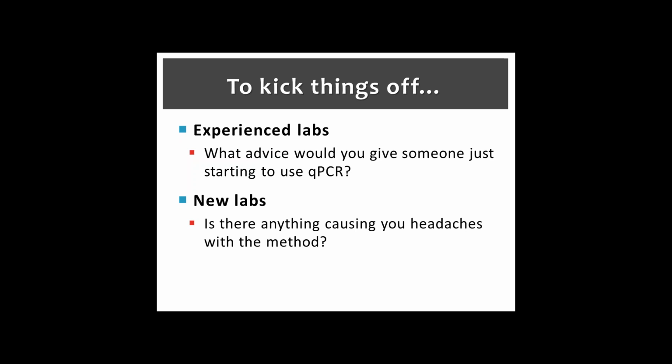All right, so in our quality assurance project plans, we have set it up in a stepwise process for all the new labs. We don't have certification. We're living by a QAP. So we use the QAPs to go through this stepwise process. First, we want your lab to be able to run a standard curve that makes sense. Once your staff are running the standard curves and everything's beautiful and you're like, yes, we got this, now you're going to get the E. coli spike samples from MSU or EPA. Then you start running those samples to see, can you run E. coli and get a result? Then you get your results, you're going to call MSU, and you're going to tell them, this is what I got.